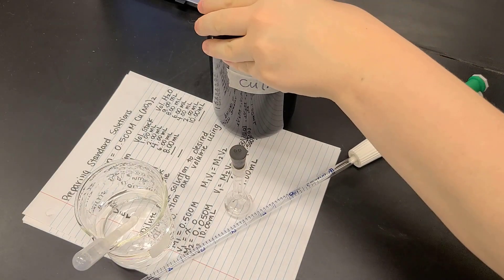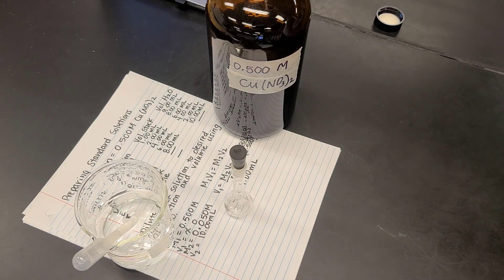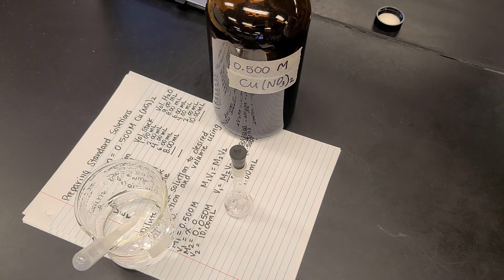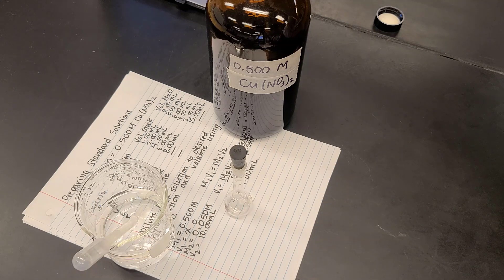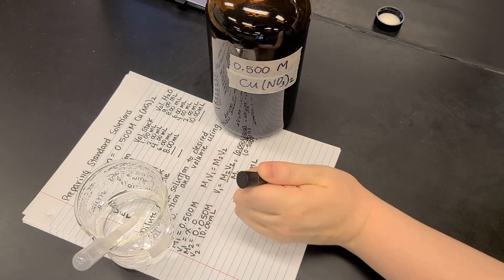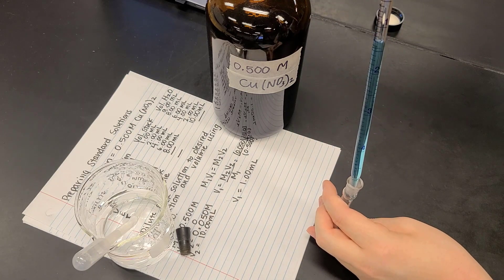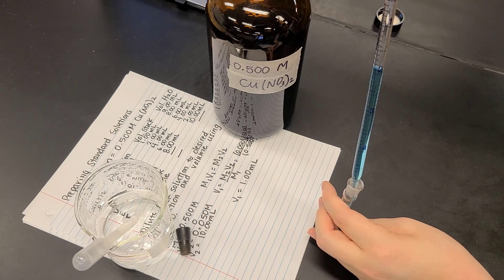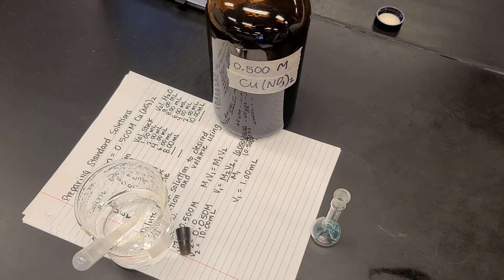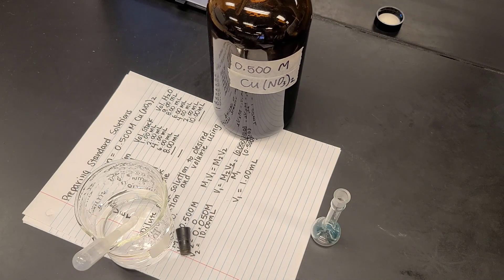I'm going to make the first solution using a 10 mL volumetric flask. I'll take my stock solution and use a pipette to very precisely measure out exactly 1 mL, then dilute it to the line on the flask with distilled water. The pipette is a tool that can very precisely measure volume — I draw the stock solution in and add exactly 1 mL to the small volumetric flask.